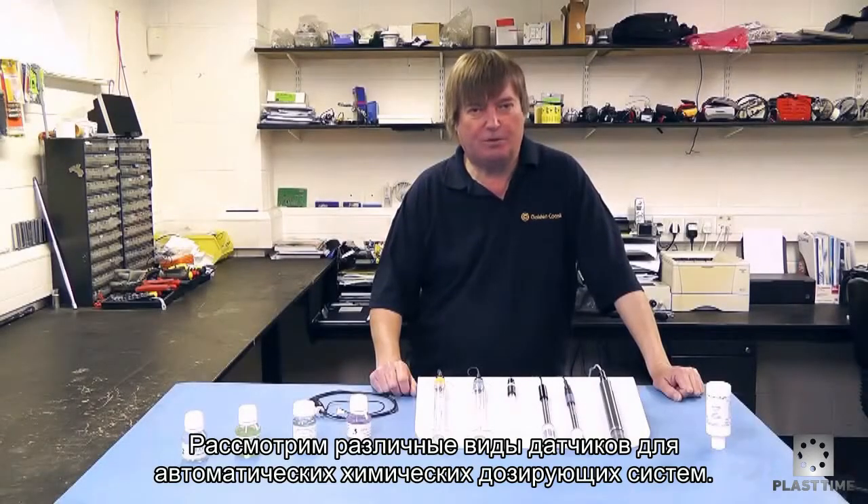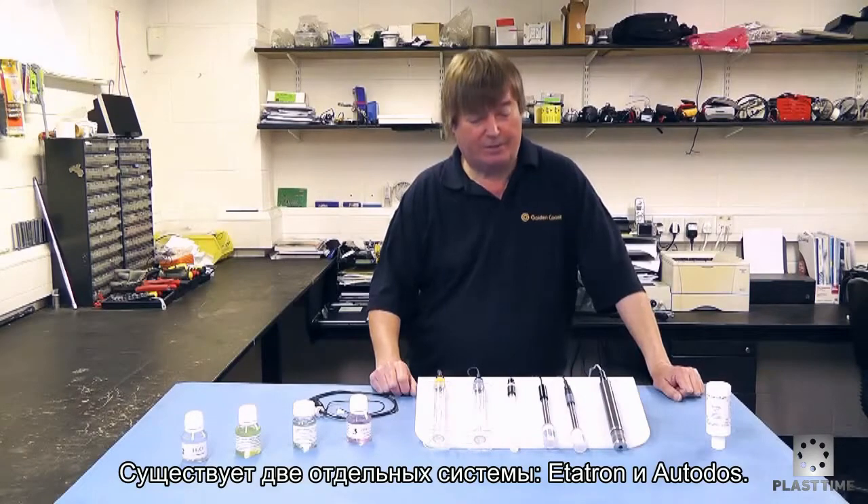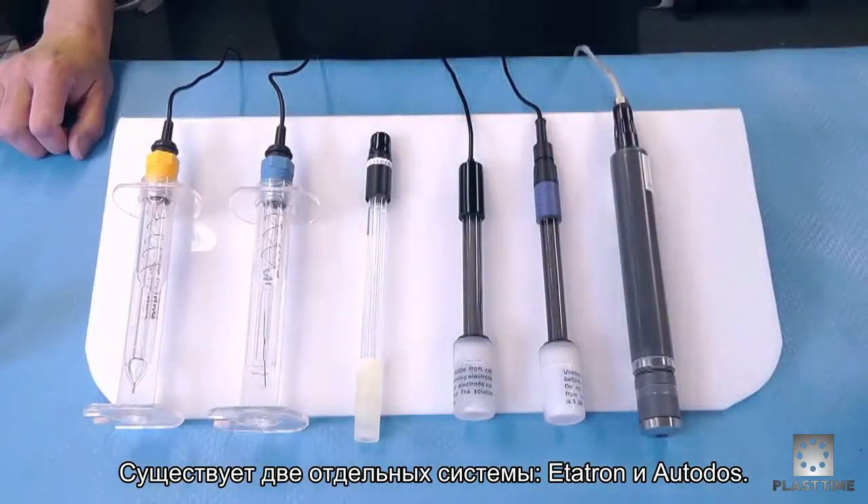We'll look at the various probe options for the automatic chemical dosing systems. There are two different types: the Etatron ones and the Autodos ones.